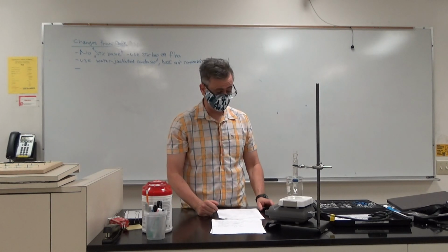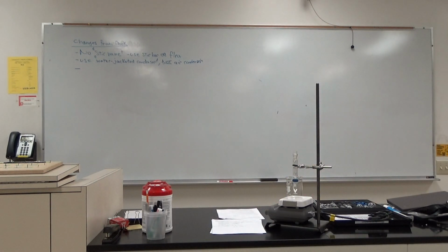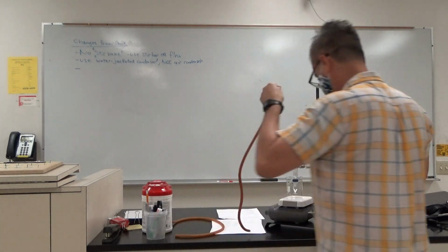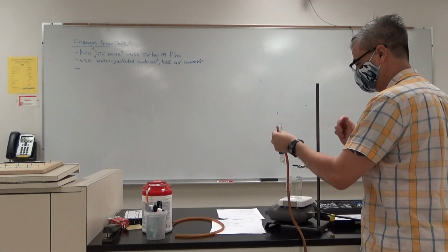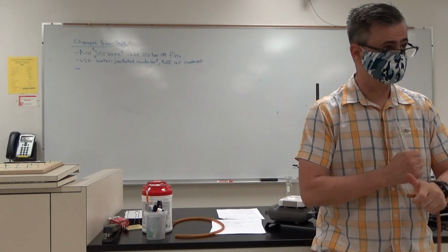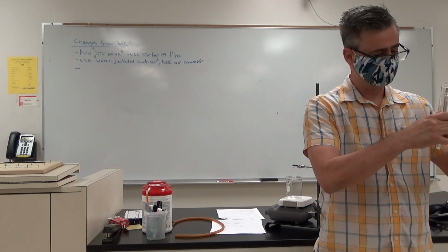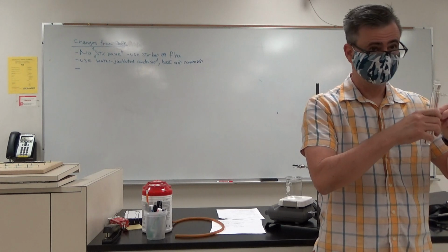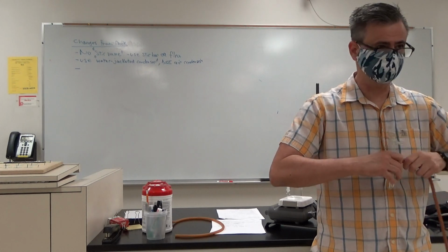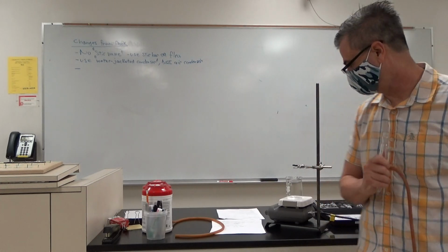And now we need water coming into these guys. Okay, so we get these hoses here. Okay. This is another place I'm putting tubing over glassware. I don't want to use muscle. I'm going to stab myself. And you can even put a little bit of water on there. Okay, and then this guy just slips over. Okay. Doesn't need it if it's resistant, just as long as it's on there a bit. Okay, that one goes on there pretty well.